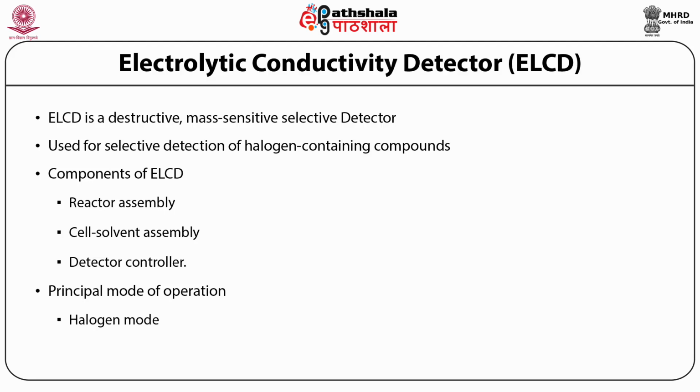The electrolytic conductivity detector can be used as a standalone detector or in tandem following a photoionization detector or any other non-destructive detector.